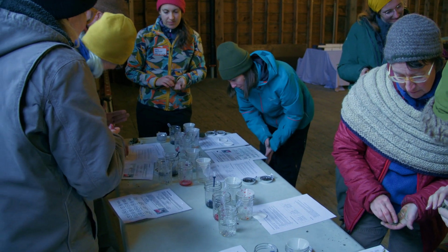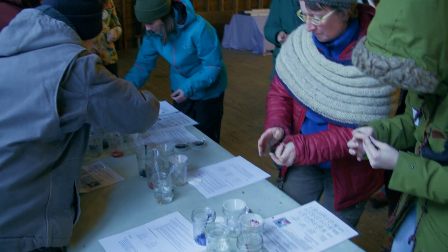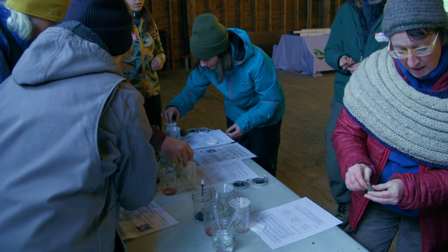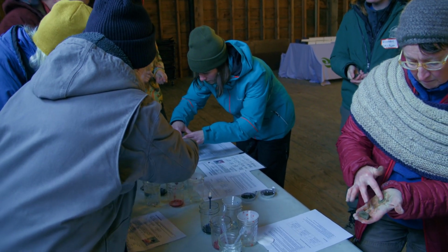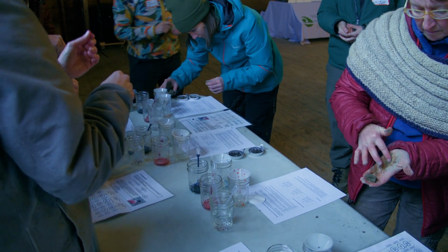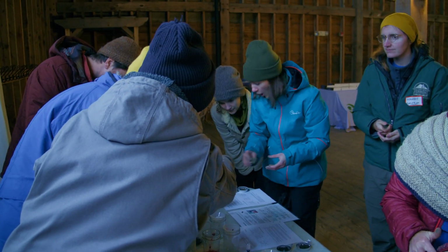So that goes in here, and you can use this just to hold the soil from falling into the glass. If your soil is like this, it's okay to squish it out so that it becomes a little more pulverized. Then you put that in here. Feel free to make it a little more pulverized and then put it in. You can use the things in your trays.